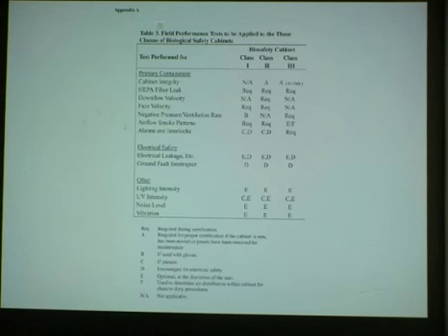Now, here's a table that tells you about the tests, the mandatory tests and the optional tests. The mandatory tests are primary containment, the cabinet integrity, HEPA filter leak, downflow velocity, face velocity of air entering from the laboratory environment into the biosafety cabinet, negative pressure and ventilation rate, airflow smoke patterns, alarms and interlocks, especially alarms with regard to the exhaust motor blower.